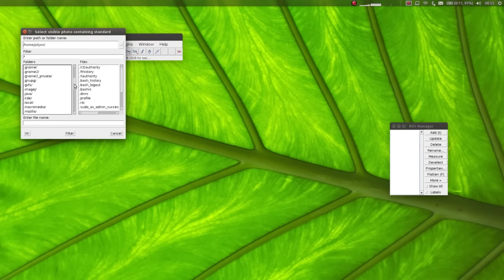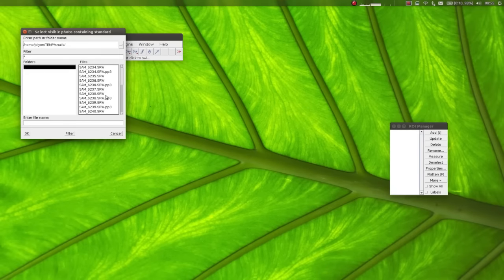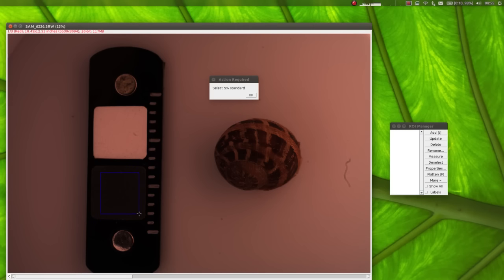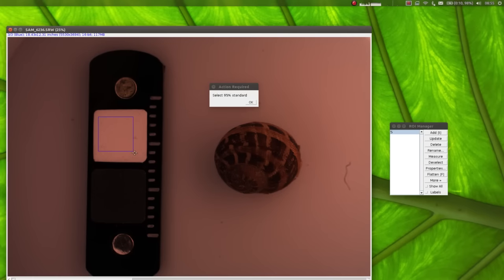Next we need to navigate to the files. So here we had this image for the visible. And it's asking me to select the area to use for alignment. And again, I'm only interested in aligning the snail, so I'll just select that. Next, it asks me to highlight the 5% standard and the 95% standard.